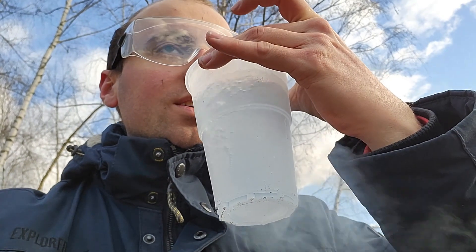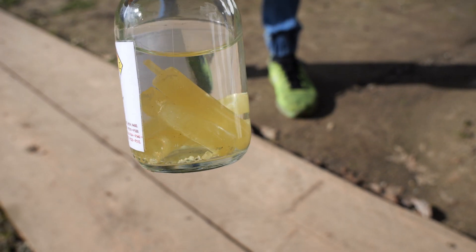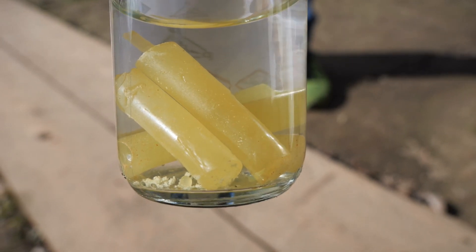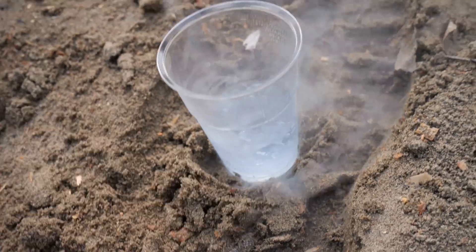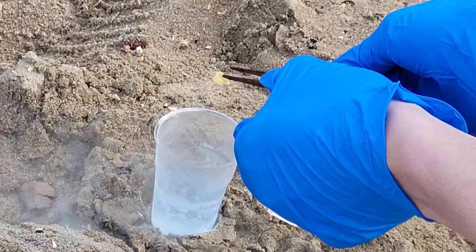Hello! Here you can see some beautiful blue elemental liquid oxygen. And here you can see another element that really loves oxygen, which is phosphorus. So today you are going to find out what happens when two elements that dearly love each other react together.